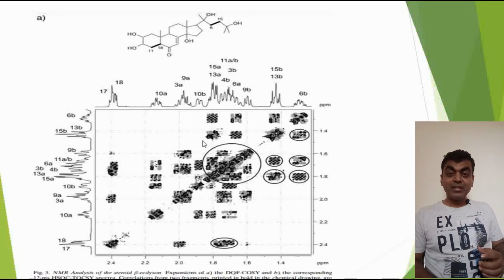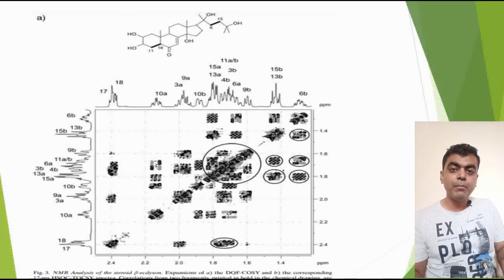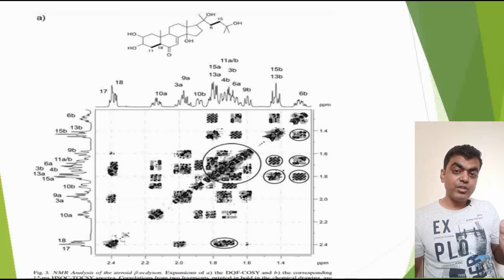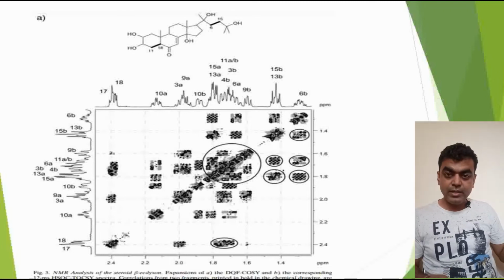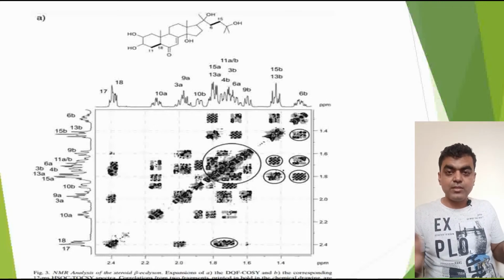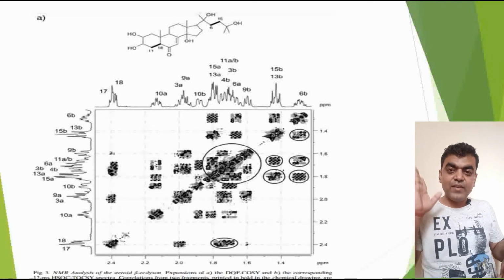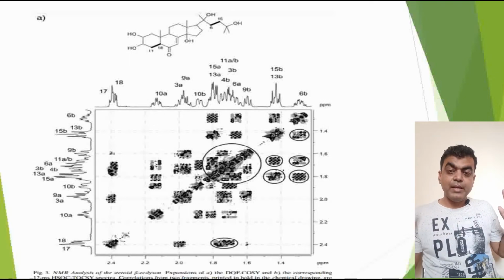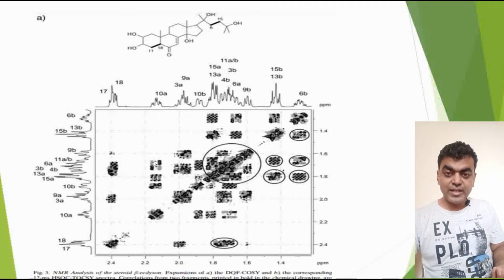Suppose one compound is bound to have multiple peaks at multiple ppm or chemical shift positions. Now, are all the positions matching or not? In a 2D, we say, okay, I see one peak here, one peak here, one peak here, and we say from the library that this particular compound is going to have three peak positions with a multiplicity so and so, and a J value of this, and you match it and say happily. But that may not always be true, because of other factors like the stereochemistry and influences like the Overhauser effect, as I was telling.